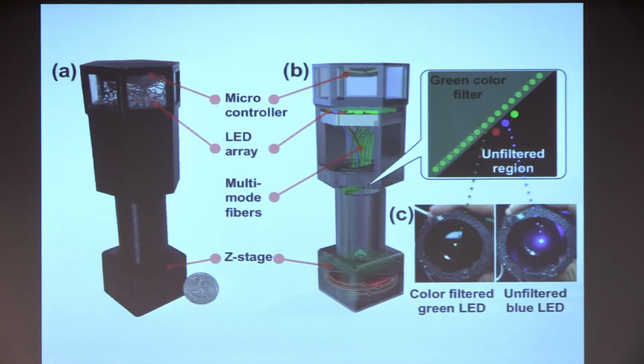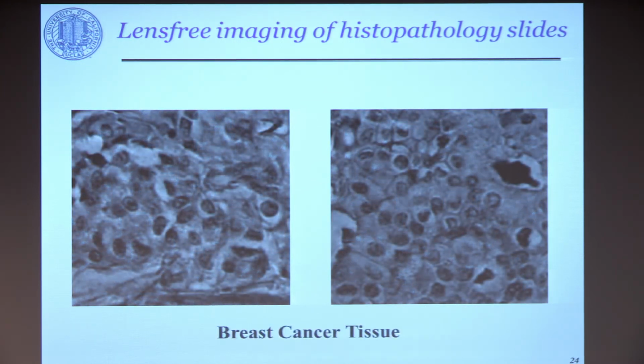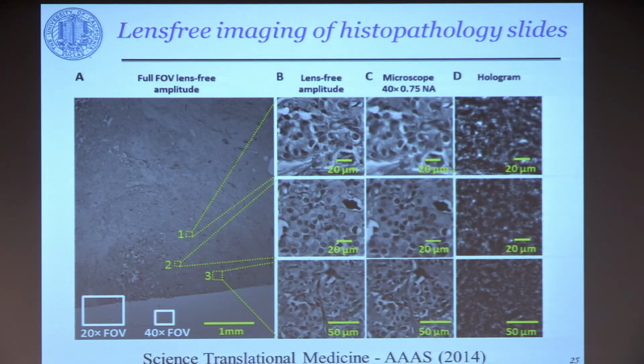This is another design which brings color to this system, so it's super resolution, color, and lens-free microscopy put together in another embodiment that is also put together by an undergraduate student. It's very sophisticated. It can take raw data that looks like this and quickly process it to give you, in this case, histopathology slides that show you subcellular features across a very large field of view. This is one of our images. If you zoom in, you would see our reconstructions, but a traditional microscope would be only looking at these kinds of fields of view.